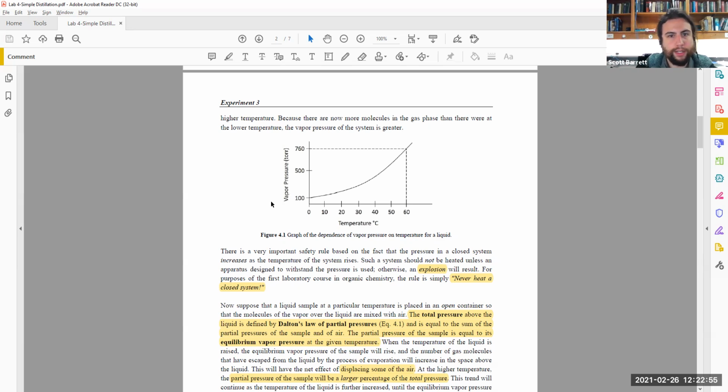at room temperature. So as you see here, room temperature is around 20 to 23 degrees Celsius, and if you have something around 150 or lower, even here, this volatile liquid starts to boil. And you have to remember as a concept, we think boiling point, we think, oh, 100 degrees Celsius water. You have to remember that that boiling point is not fixed. It is temperature and pressure dependent in this given system because it's a closed system.